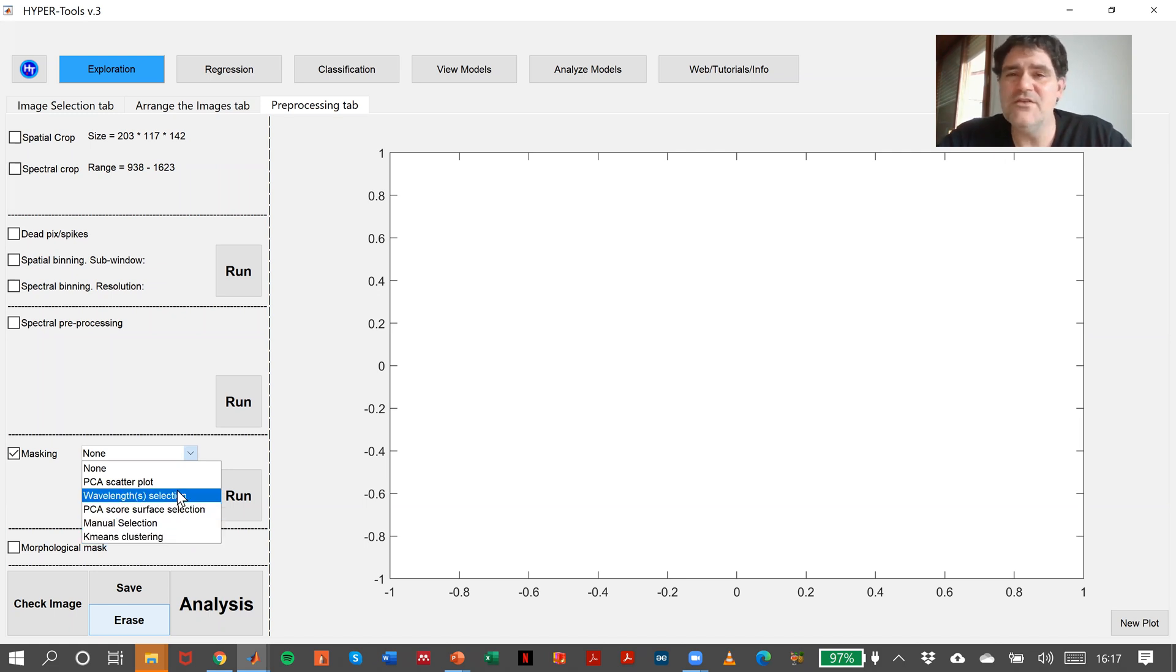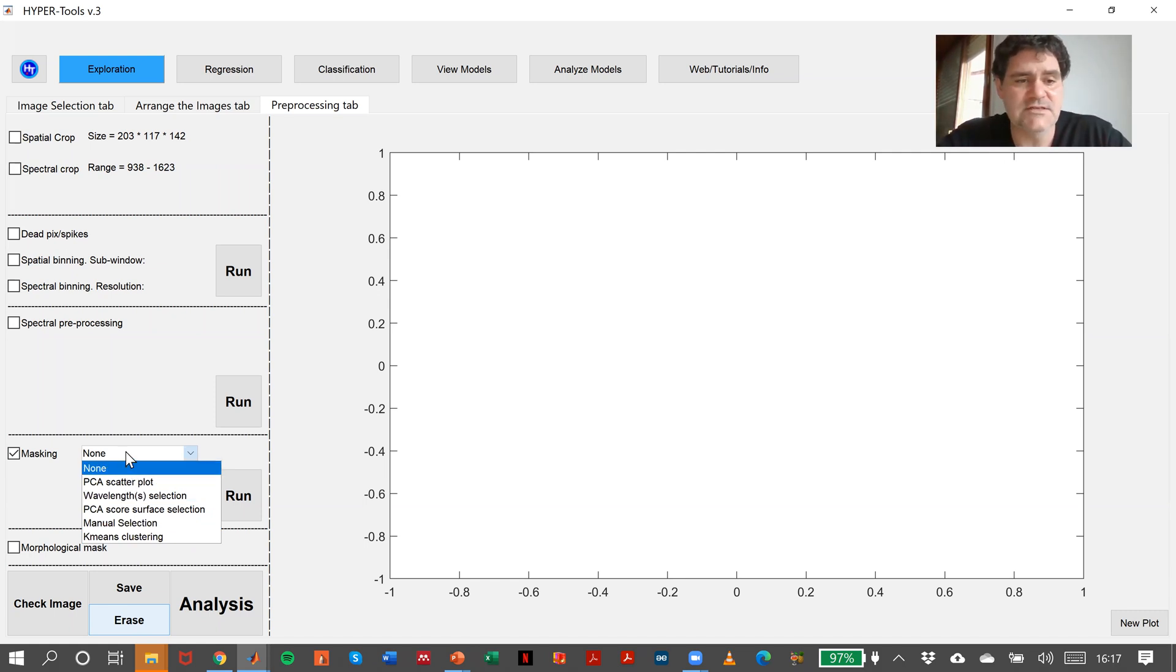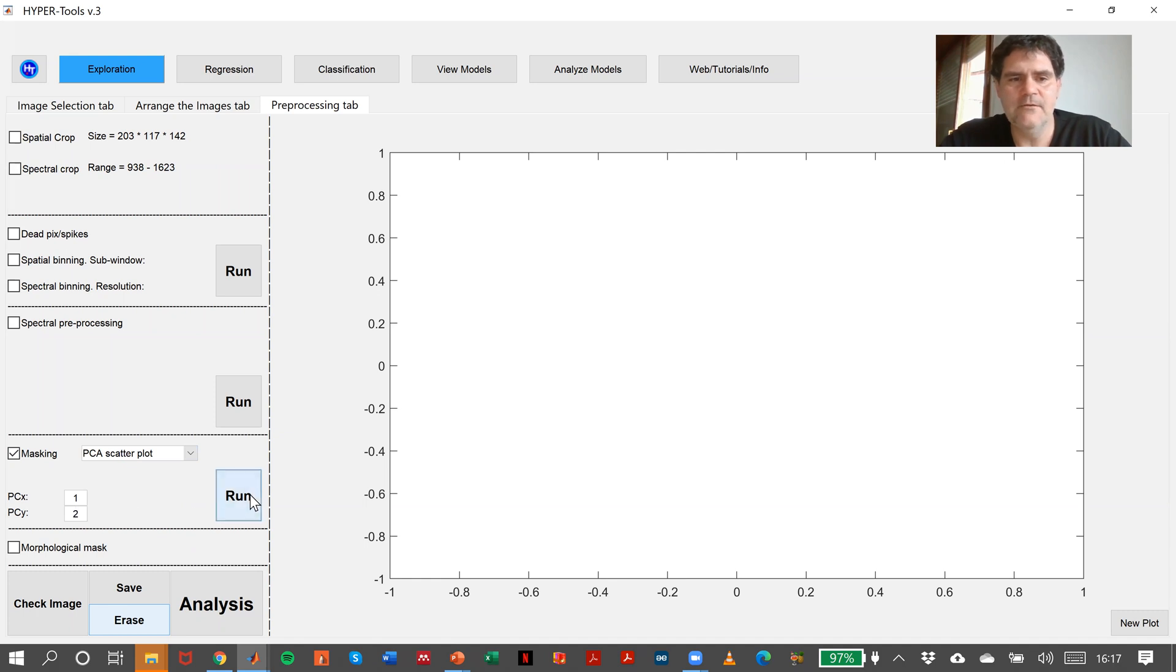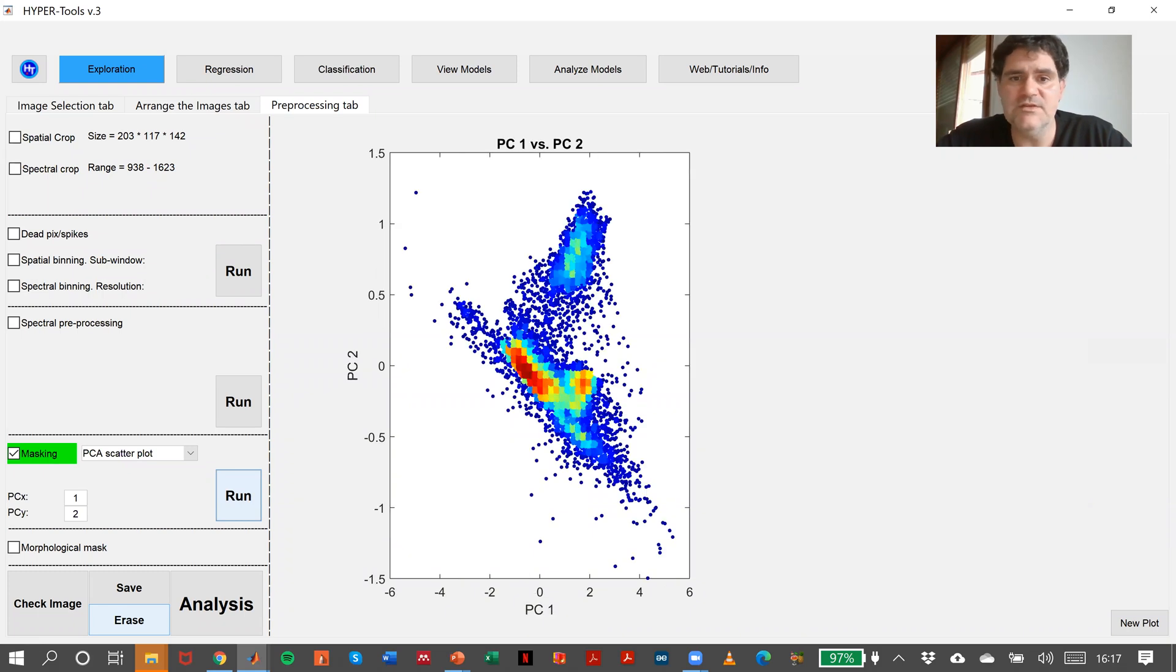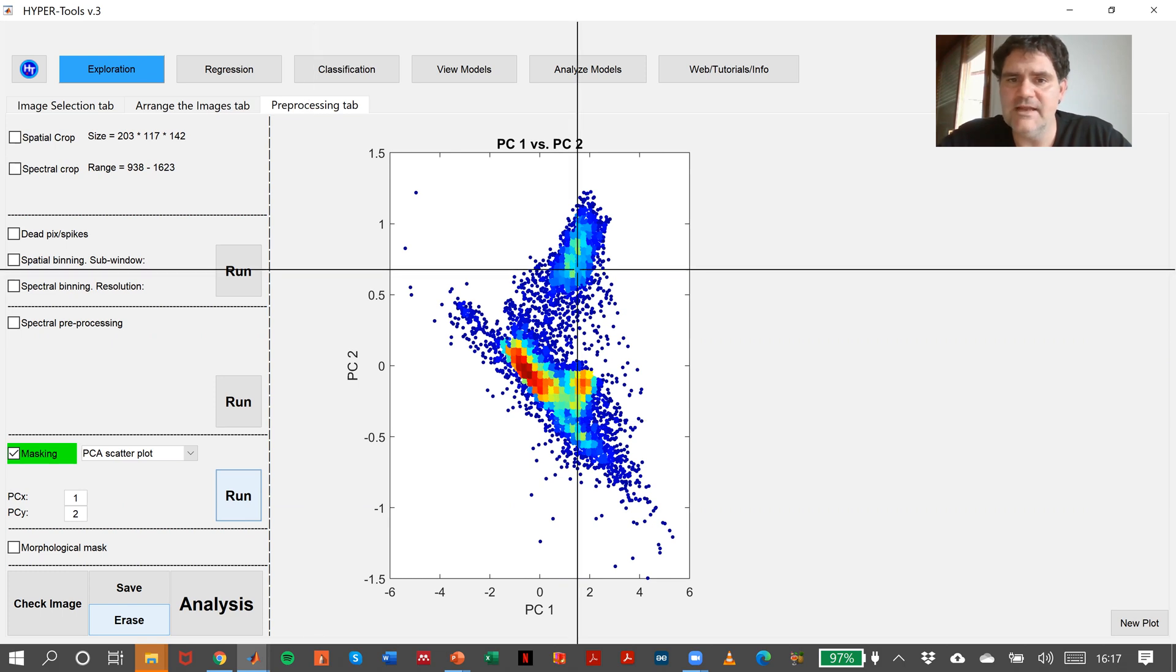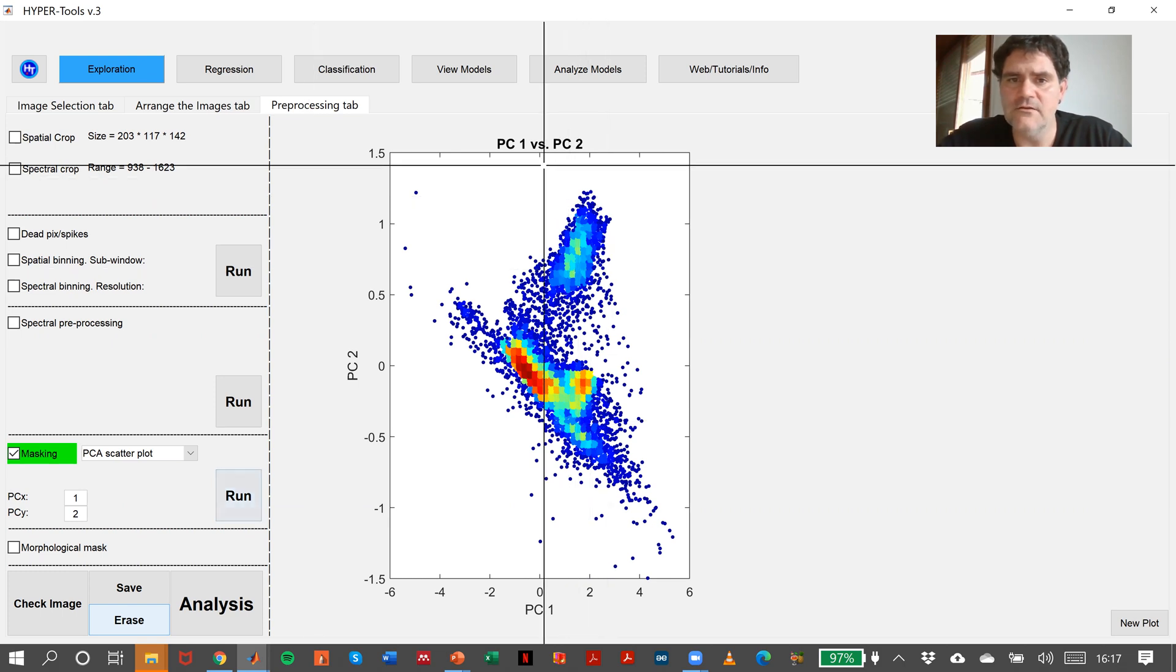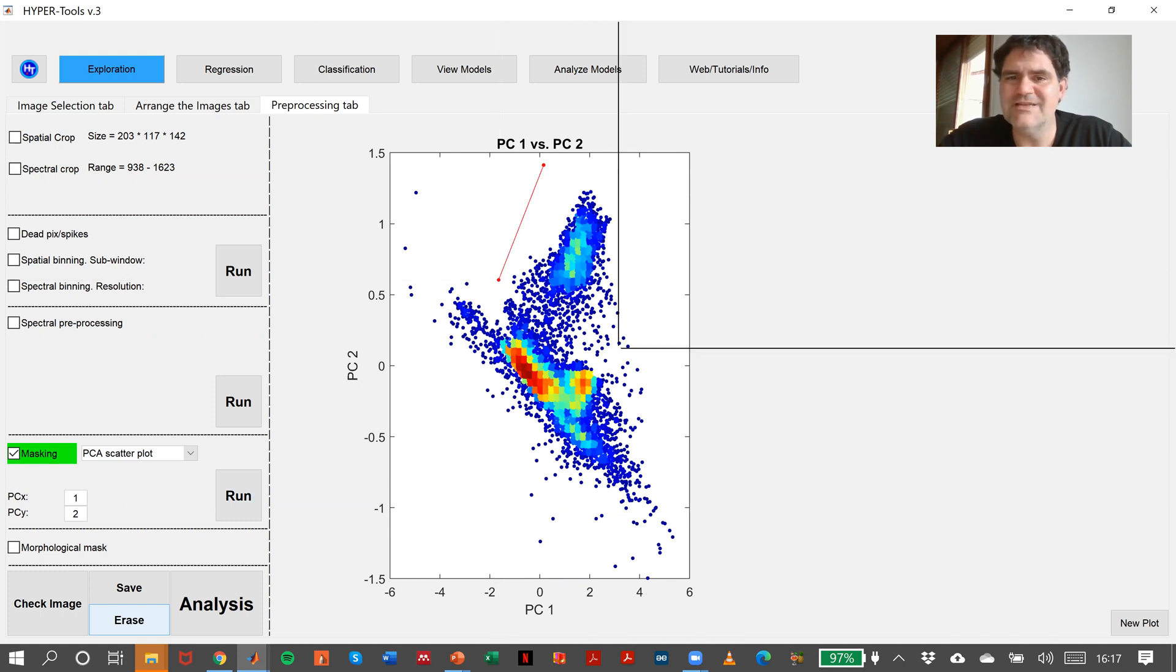Which method is the proper one is the one that solves the problem of removing the parts that we want to remove in the image. For instance, in this case, if I do PCA Scattered Plot in PC1 and PC2, the HyperTools will perform a PCA model and will display the Scattered Plot of PC1 against PC2.